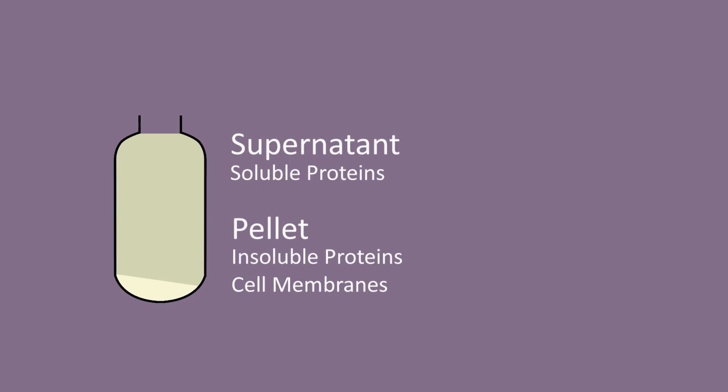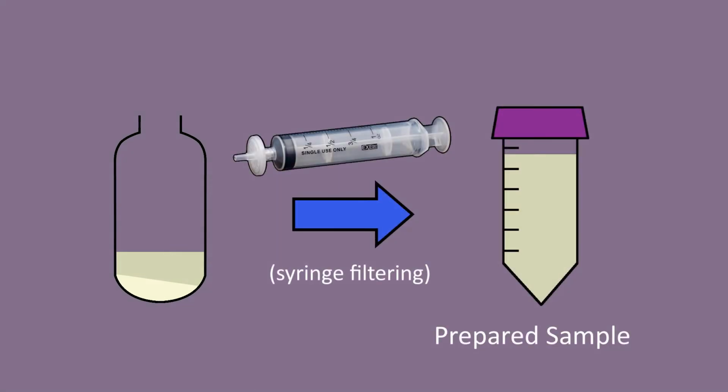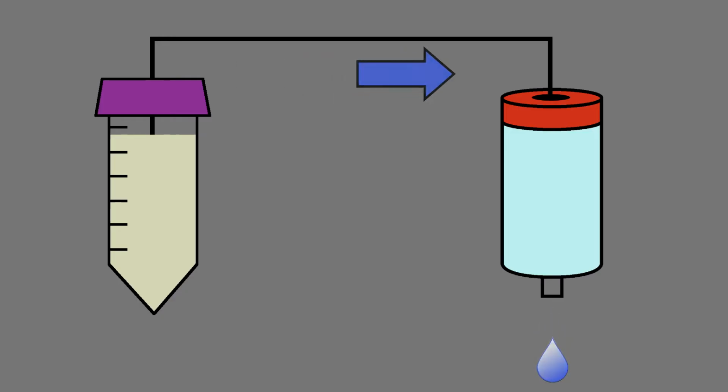The supernatant contains a majority of proteins we have just released from the cell. We transfer the supernatant out of the tube, then filter it to get rid of any loose debris and large tangles of DNA not digested by the DNase. We then load the prepared sample into the purification column.